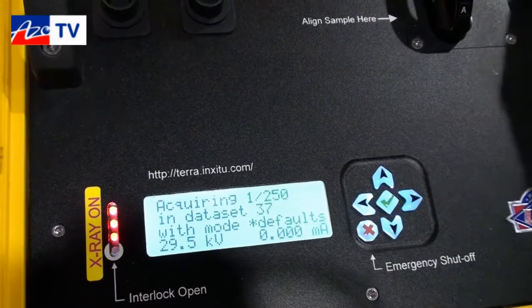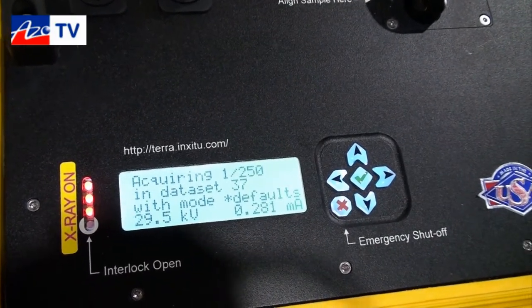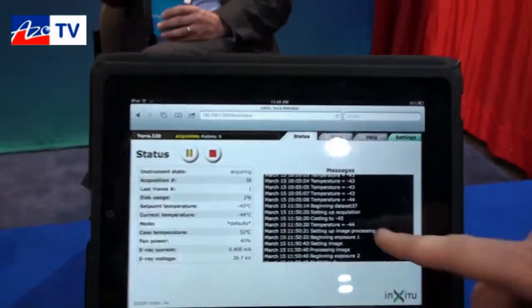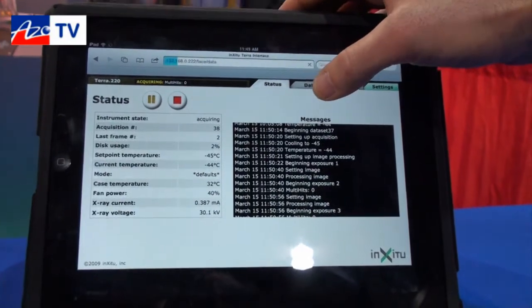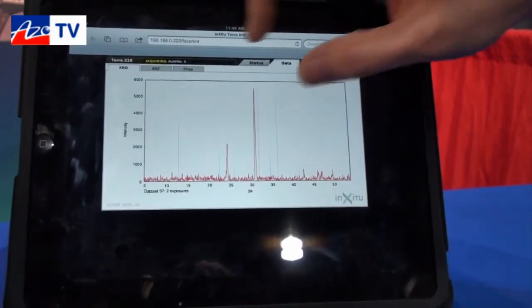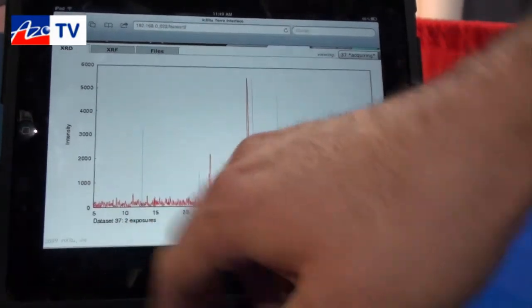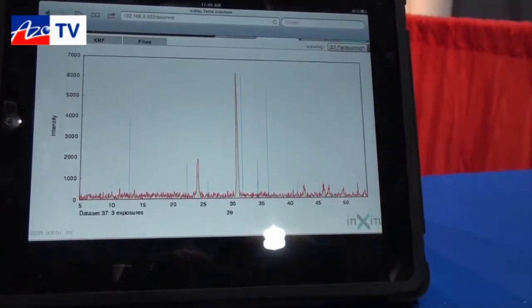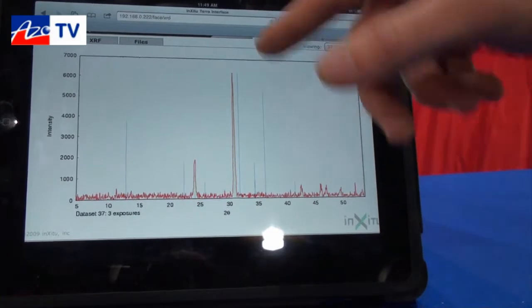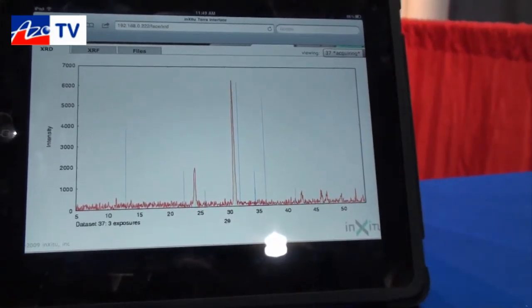Everything is being saved to the onboard computer on the instrument. At any time, somebody with a wirelessly or Wi-Fi enabled device can view the information and download it to their PC. I just have a regular iPad connected to the instrument, and you can see the acquisition is taking place. I already have my first diffraction pattern showing up. We constantly take a picture of 55 degrees 2-theta, and every 15 seconds it'll update — we get better and better peak-to-background ratios and less noise overall. That allows us to get diffraction patterns in a fraction of the time that a large system would take.